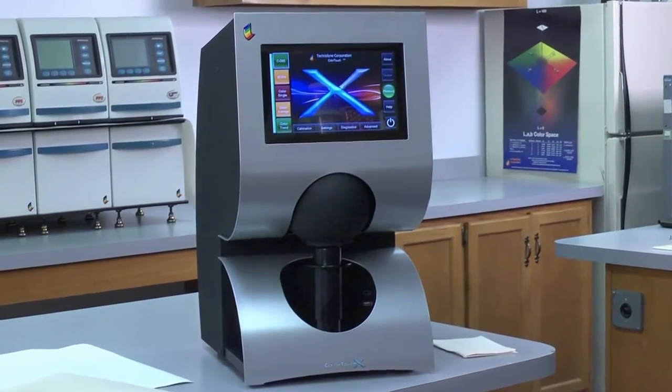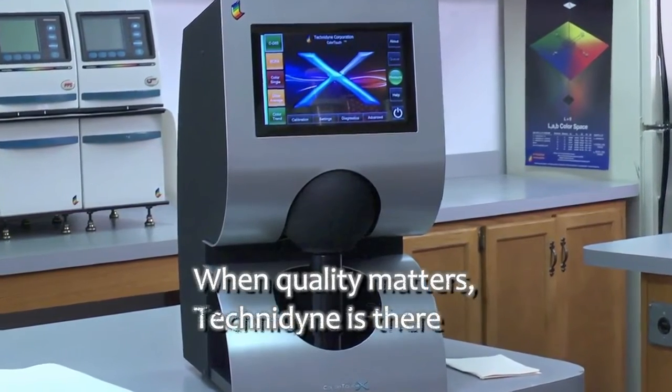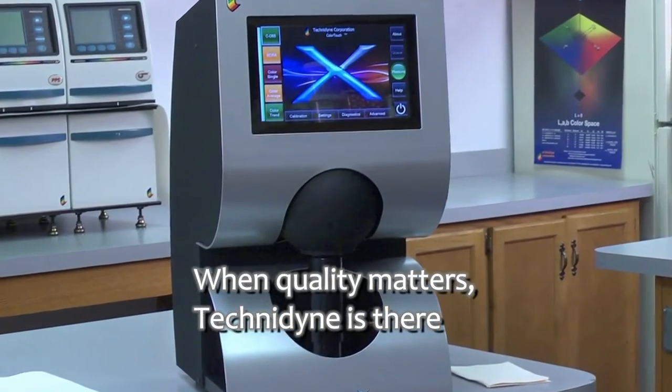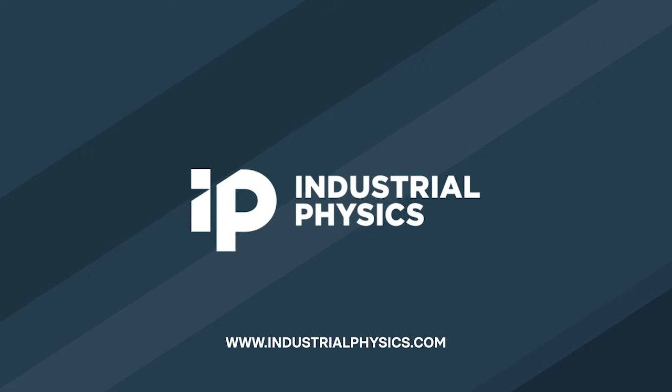Some customers have been able to pay for their Color Touch X within two months of purchase, and you should find out how. Learn more from a Technodyne representative today.